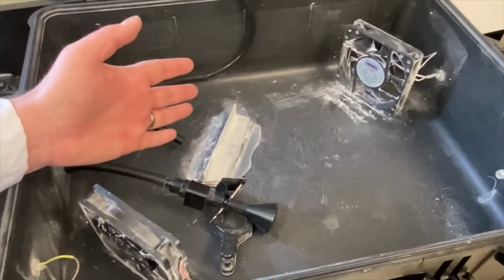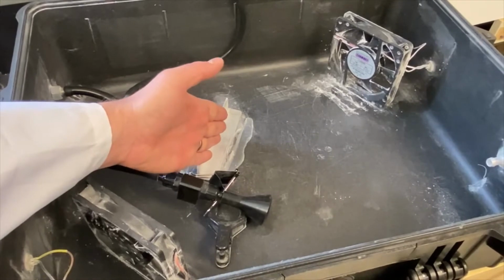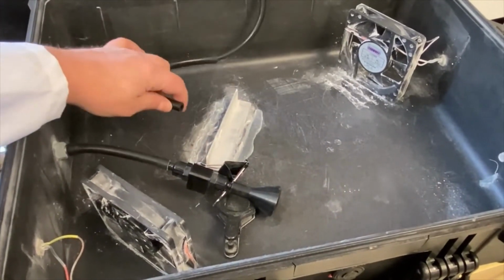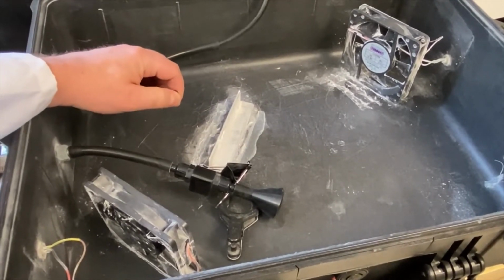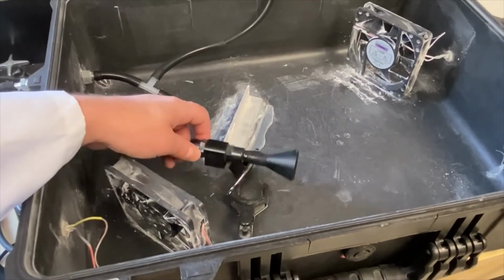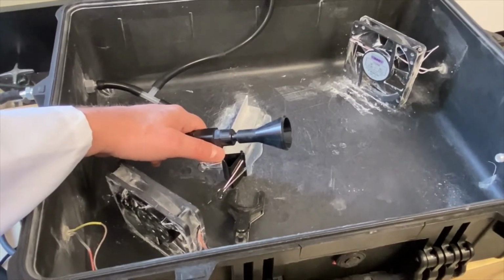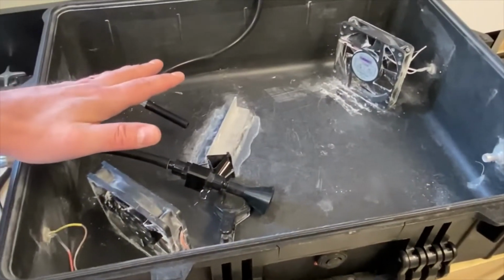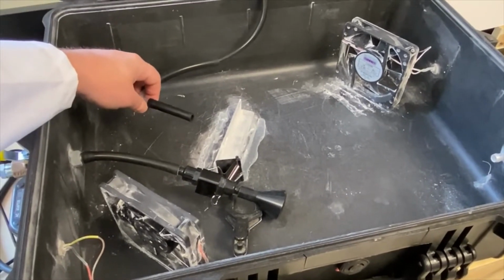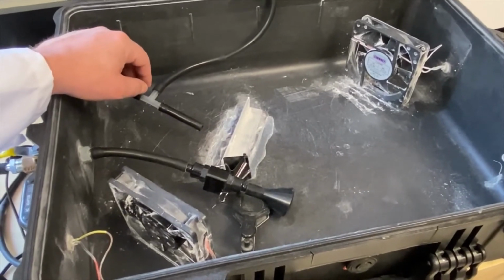And then we take the mask as it's attached to the aluminum coupon that I showed you, place it in here, and then attach to the back of that a hose that draws air through the mask. And then we're able to, through this sampling port, measure the concentration of particles in the air in the chamber. And through a second sampling port attached on the back of the tube that pulls air through the mask, we're also able to measure the particles.